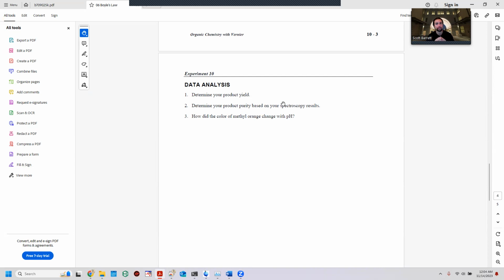So just make sure that you have that distinction for when you take your final: in the azobenzene or methyl orange situation, we're talking about the amount of concentration relative to purity of a total sample. Whereas when we're looking at the aspirin sample, when we look at that absorbance, you're finding the absorbance of salicylic acid, and then you would take that and subtract that from the total to find out the total percentage of pure aspirin that you have.